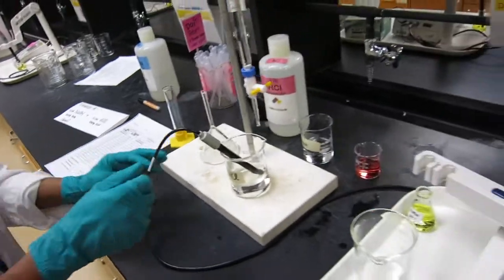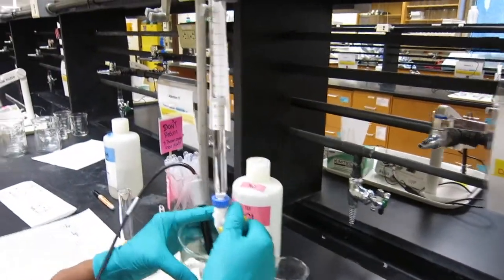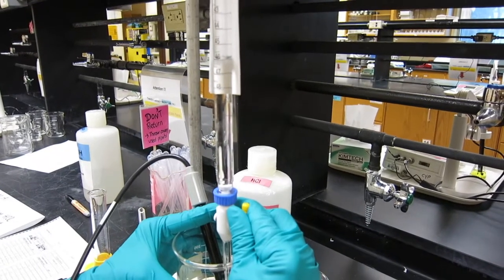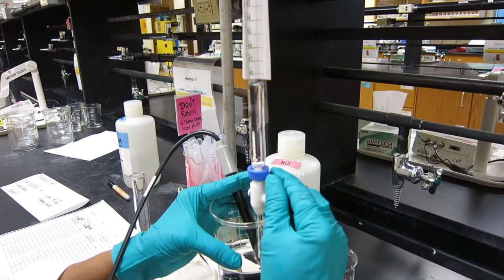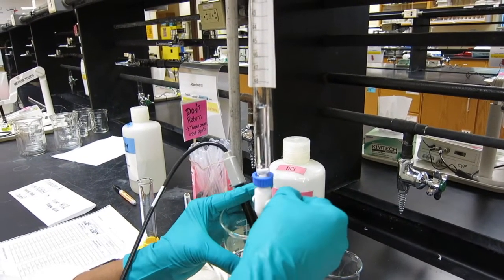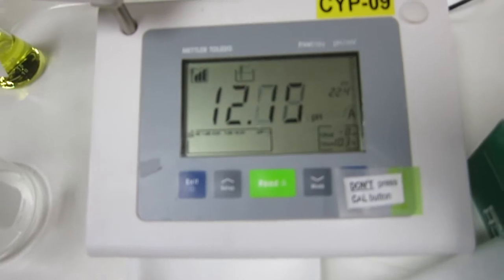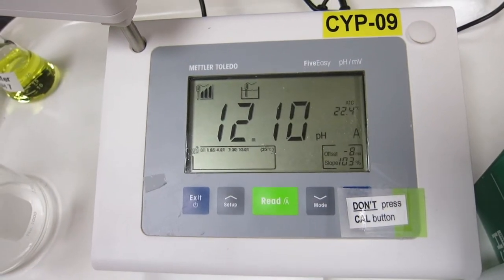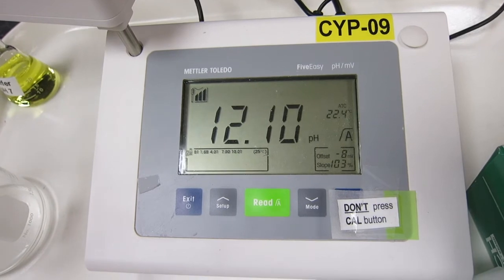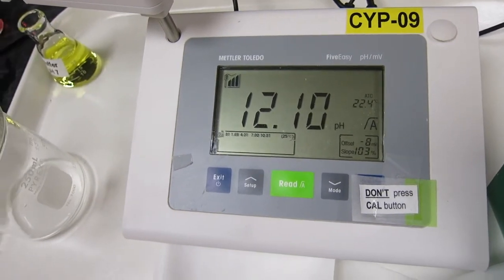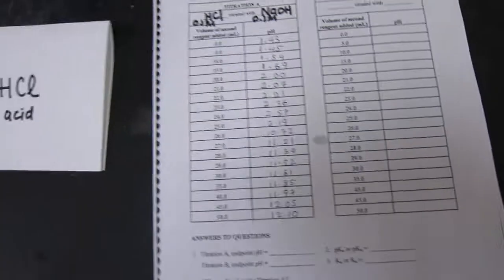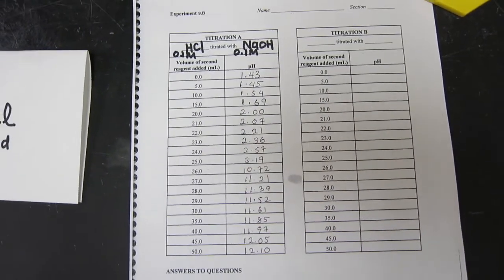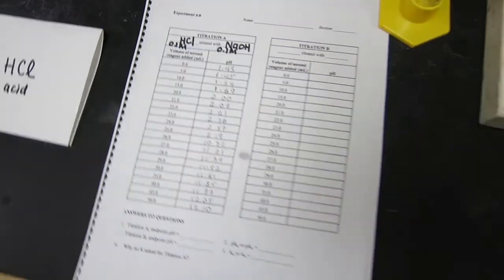We're going to have one last dispense here down to 50. We're going to read that again. This is our last reading for this titration part A. This is 12.10. So we complete our titration part A. We're going to give this form to you.